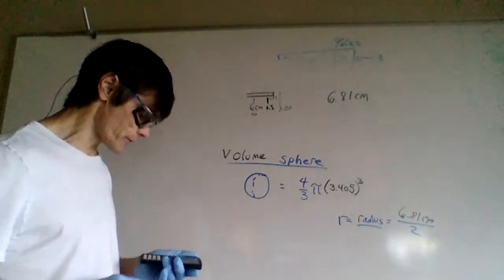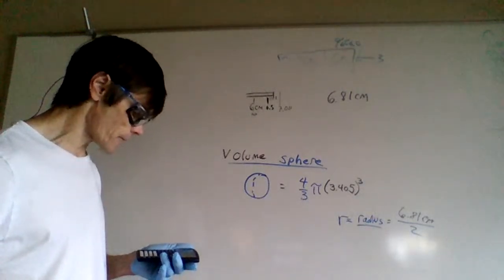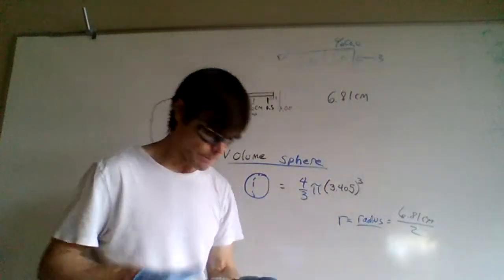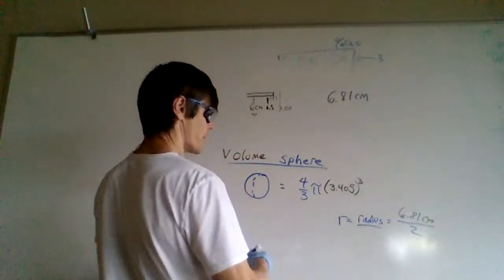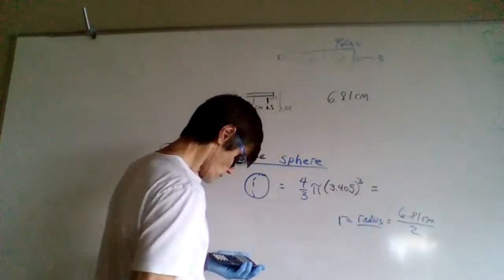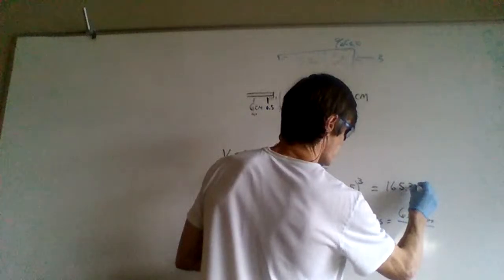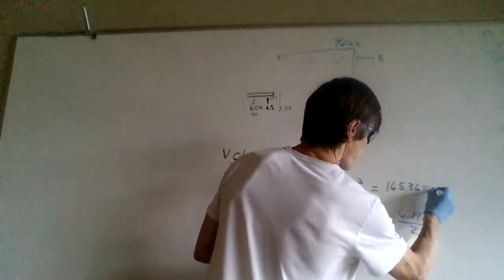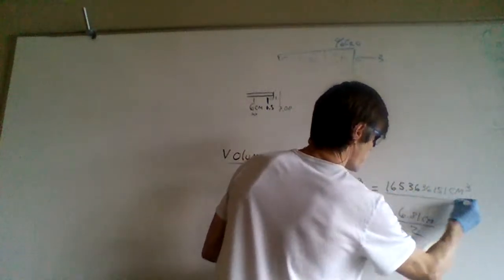I got 165.36, and I'm going to limit myself to 3 significant figures, but let's keep up our data: 165.3636151 cubic centimeters.